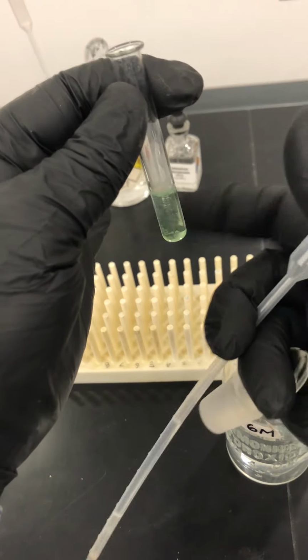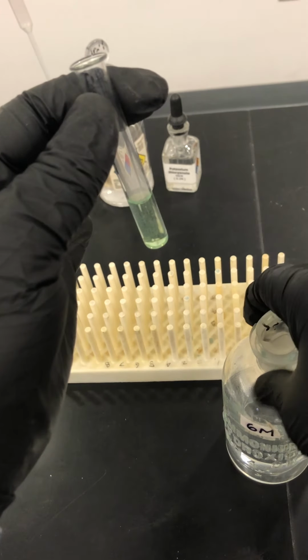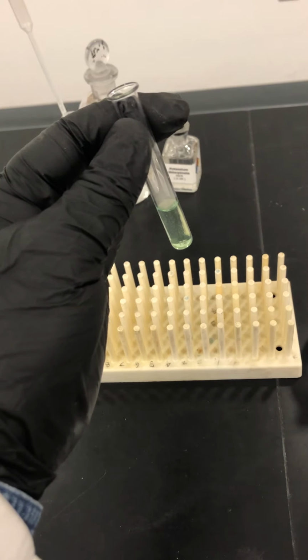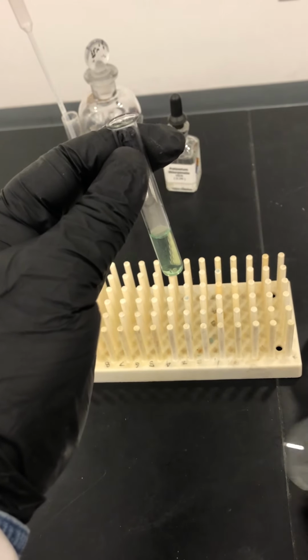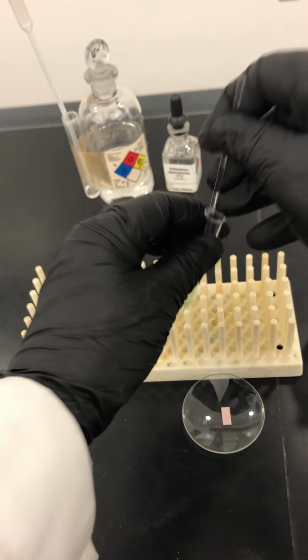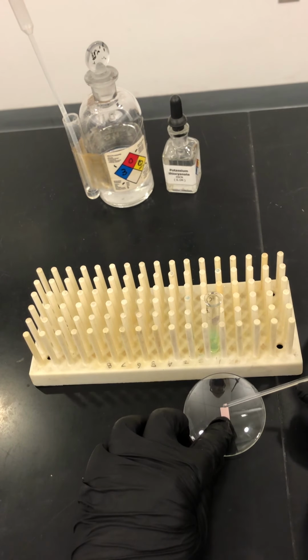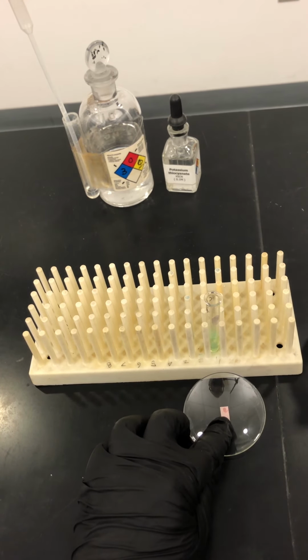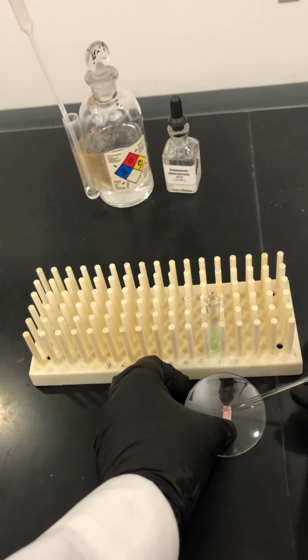Now, you might start getting concerned and say, well, isn't something supposed to be happening right away? Well, here's the thing. You have to make sure that you have added sufficient ammonia. So one thing to do is to test the acidity of this. I'm going to bring back another little piece of litmus paper, and I'm going to take my sample and test it. Let me do another dab here so you can see the whole effect.